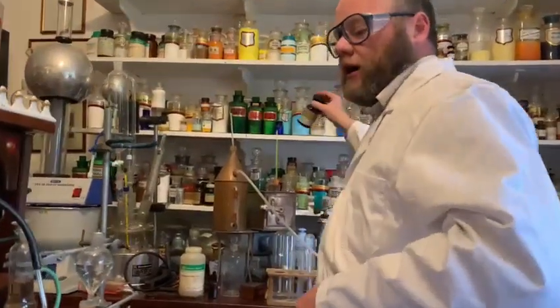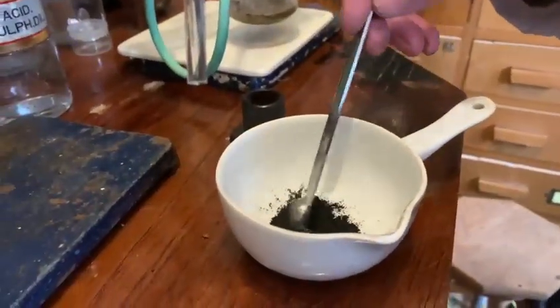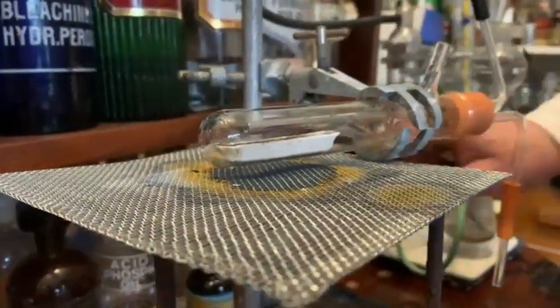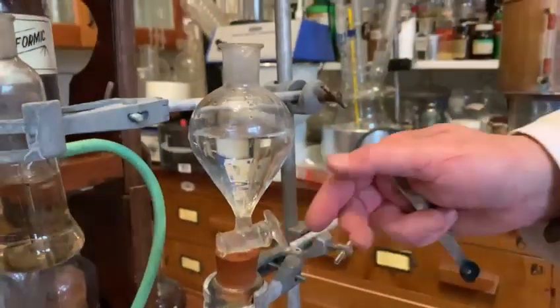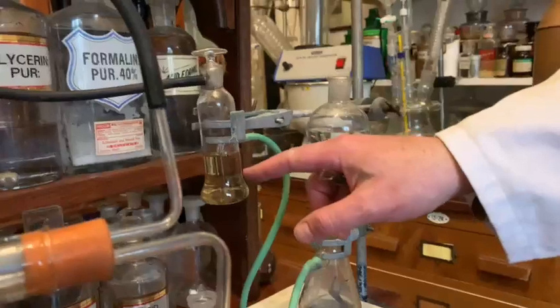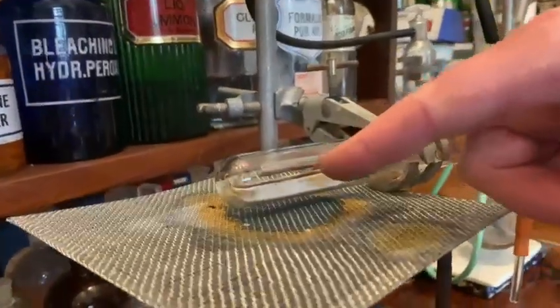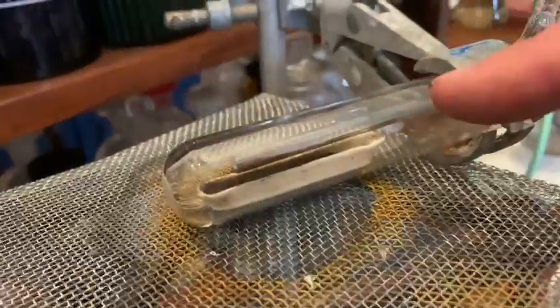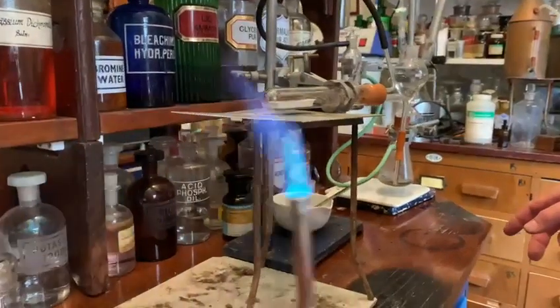Hello, in today's experiment we're going to reduce some copper oxide using hydrogen. Copper oxide is a black substance — as you can see it's black powder — and we've taken a little of this black powder and put it into this little porcelain combustion boat here in this combustion tube. In this flask we've got some magnesium turnings and some dilute sulfuric acid. The hydrogen is going to be bubbled through concentrated sulfuric acid to dry it, then pass into the combustion tube, where it will combine with the oxygen molecularly bound in the copper oxide. We should end up with a nice bright red powder of elemental copper at the end of this experiment.